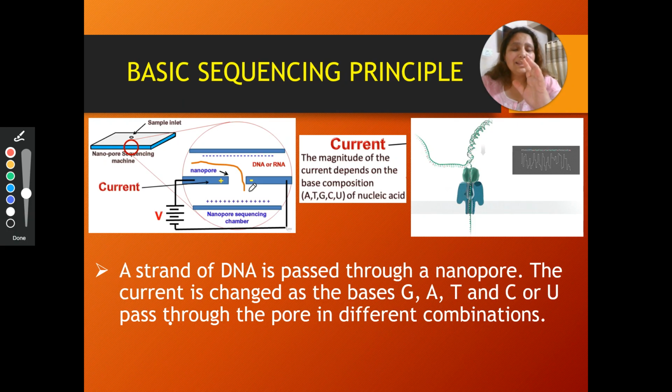So similar thing is happening over there कि इस nanopore के अंदर क्या हो रहा है, the electrolytes are passing through this pore, और जितने electrolytes हैं they are passing because there is a potential difference across this membrane.